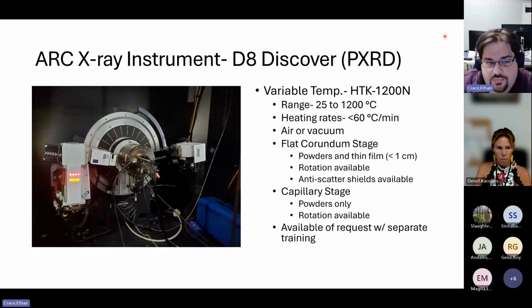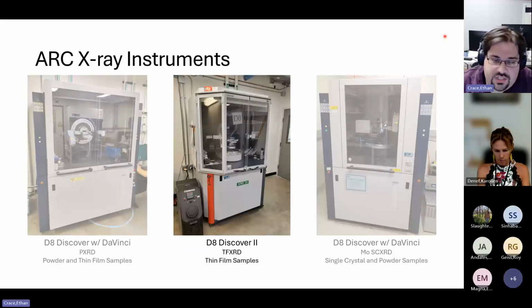There hasn't been a lot of call for this stage recently, so it's on a request sort of system. So if you're at all interested in using this stage, you can send me an email. We'll block out time for this to be installed. If it gets used more and more frequently, we can also change the schedule to work it so that this can be mounted on a more regular basis. So that's the powder system.